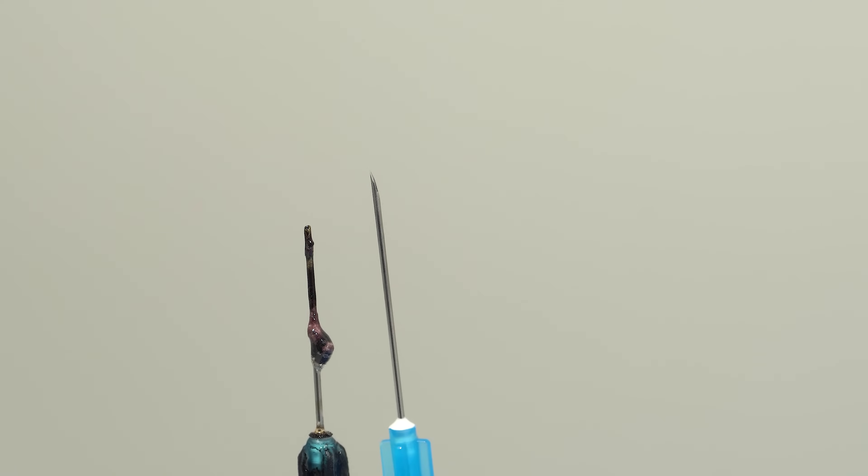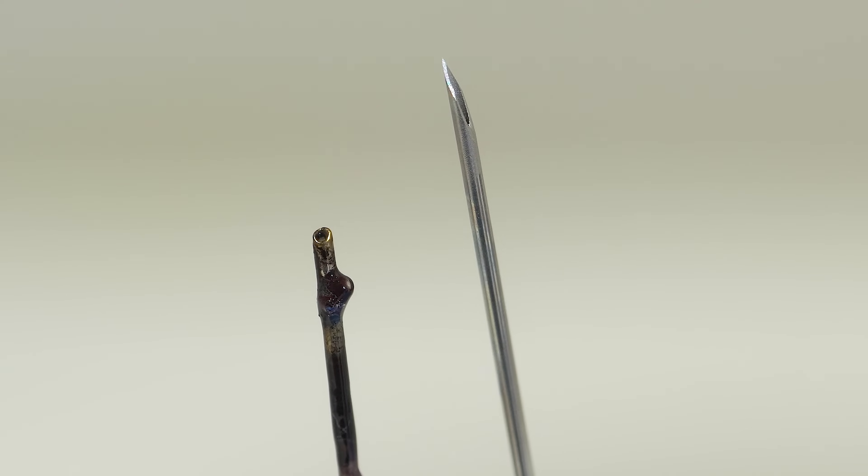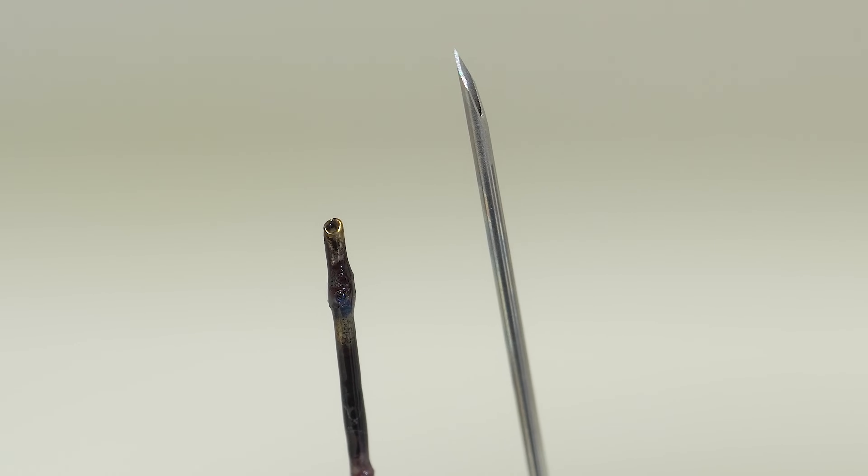Look how the steel needle of the syringe melted during such a reaction. Unfortunately, the glass cylinder also suffered.